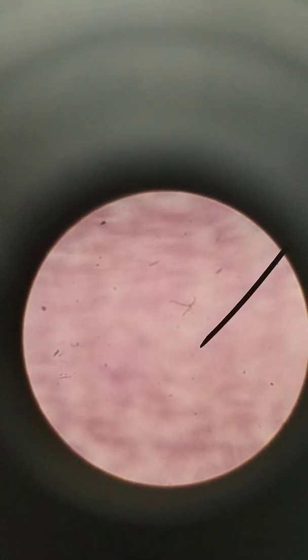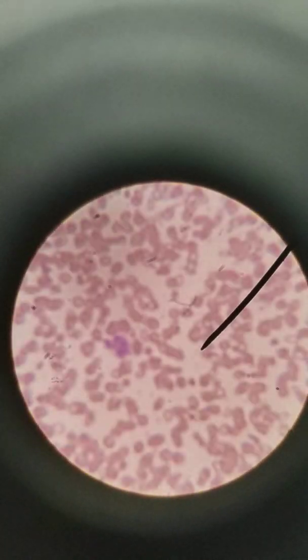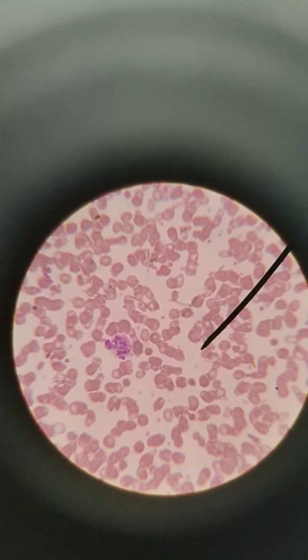All right, switching to a different slide. Let's go with this type of anemia. Again, we're going to stick to 1000x oil immersion. Let me get it ready. Let that oil settle in. There we go. Okay.